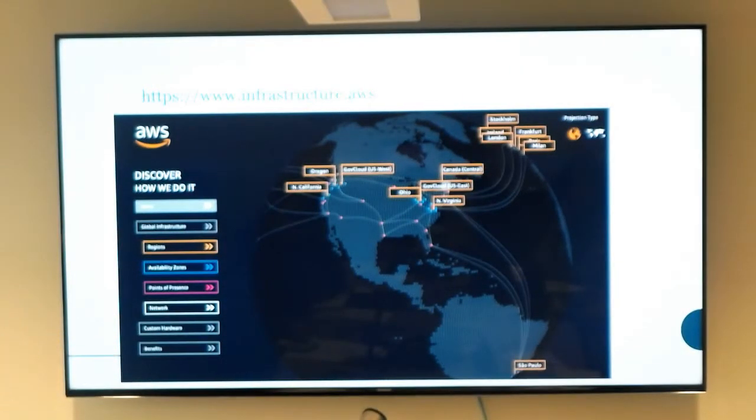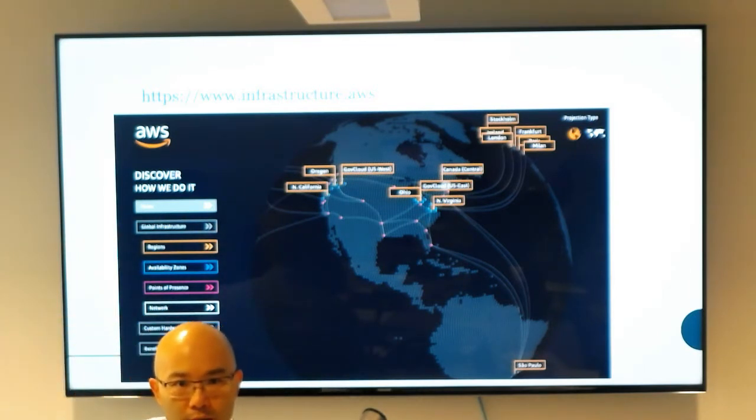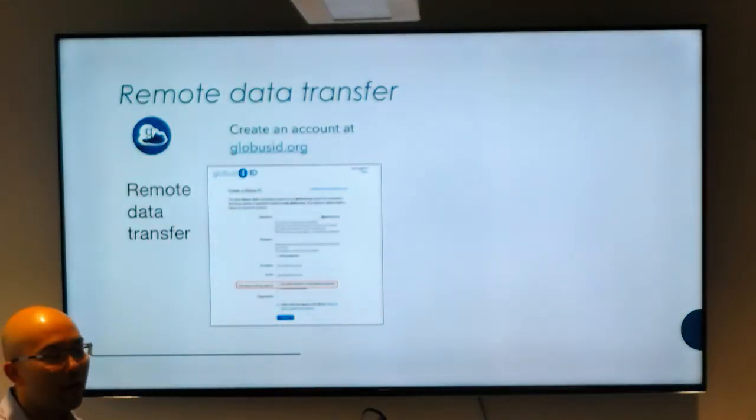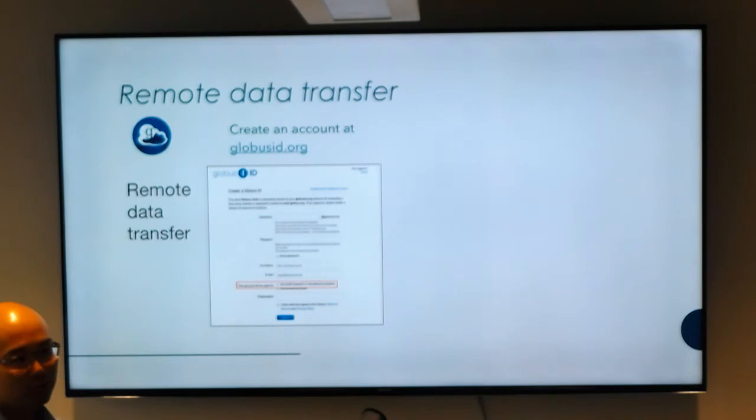But something that's really interesting that we're trying to make use of is cloud computing. In particular, for this workshop, we're using Amazon Web Services. They have on-demand computational infrastructure that we're going to be making use of. And that is what we find quite economical for people that are occasional users of EM, and also people who are just getting in the field and don't have hardware.